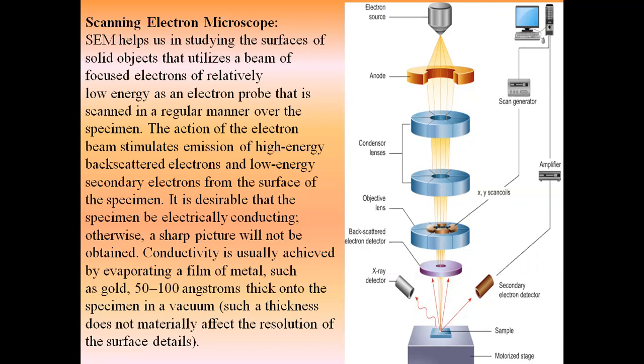And there can be another possibility: once the electrons hit the sample, they may reach inside and the sample may generate a photon.